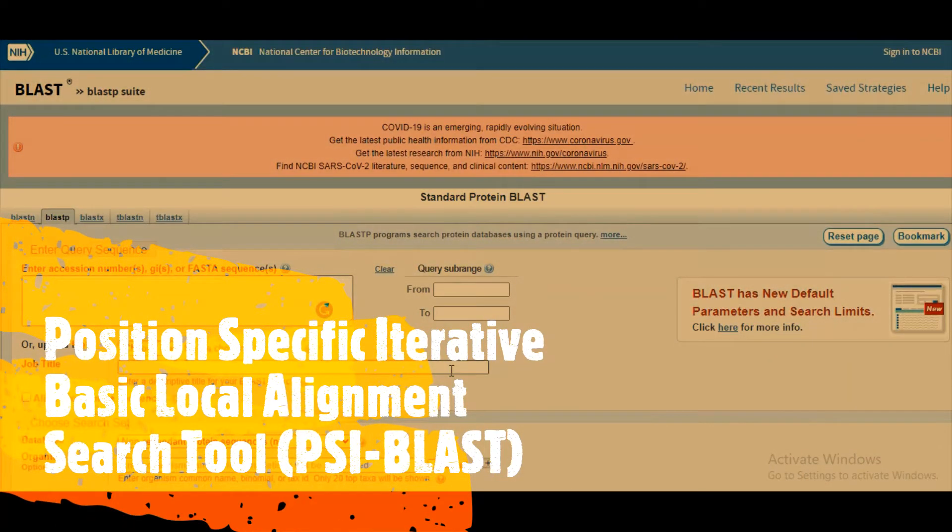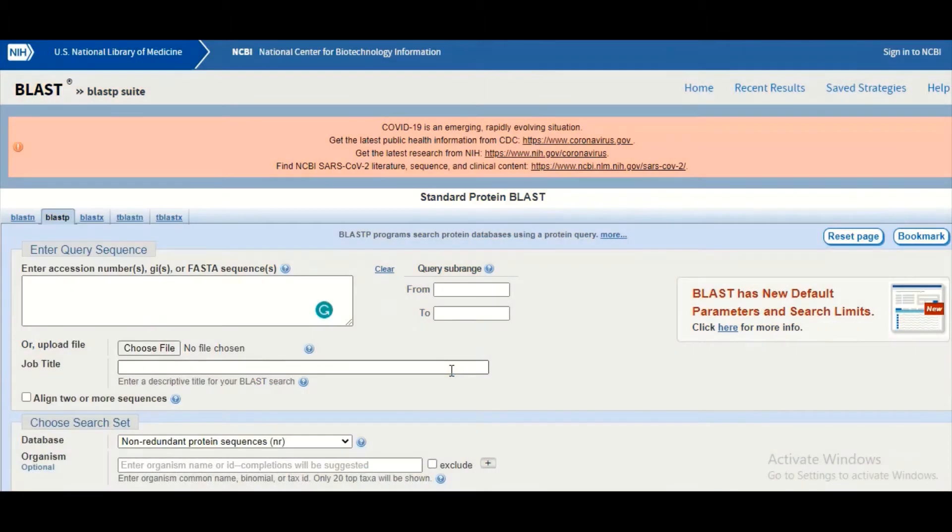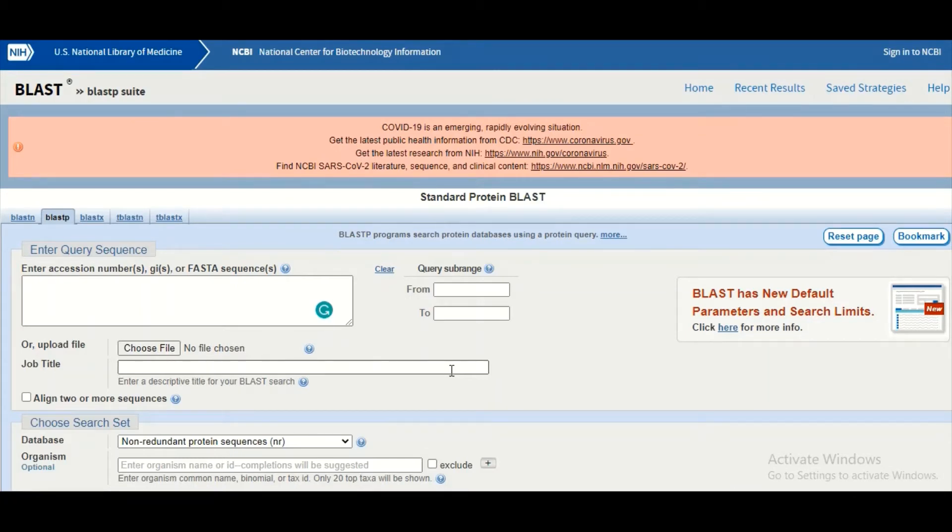Hi, in this tutorial we are going to perform position-specific iterative BLAST. This BLAST program is also known as PSI-BLAST, and this is a powerful version of the normal BLAST program. In the regular lectures we have talked about the word algorithm.